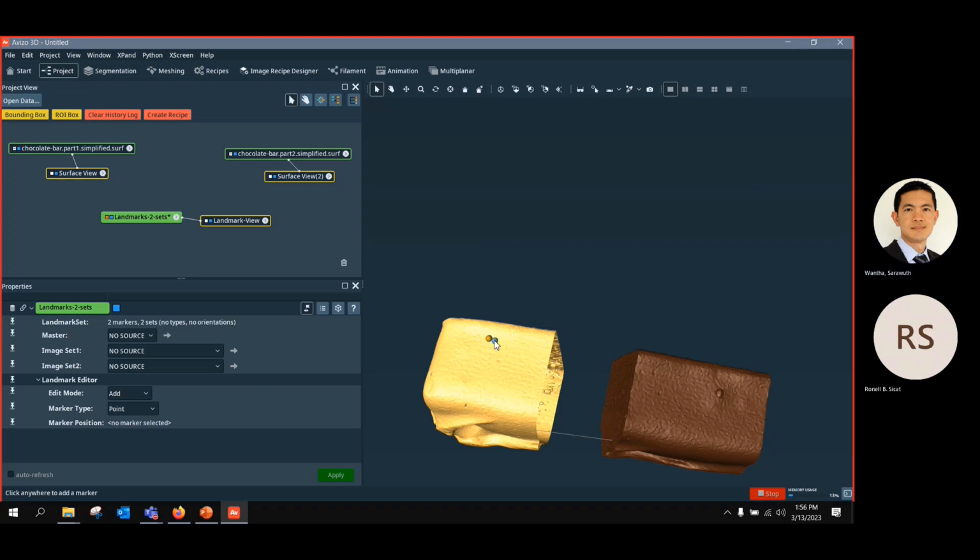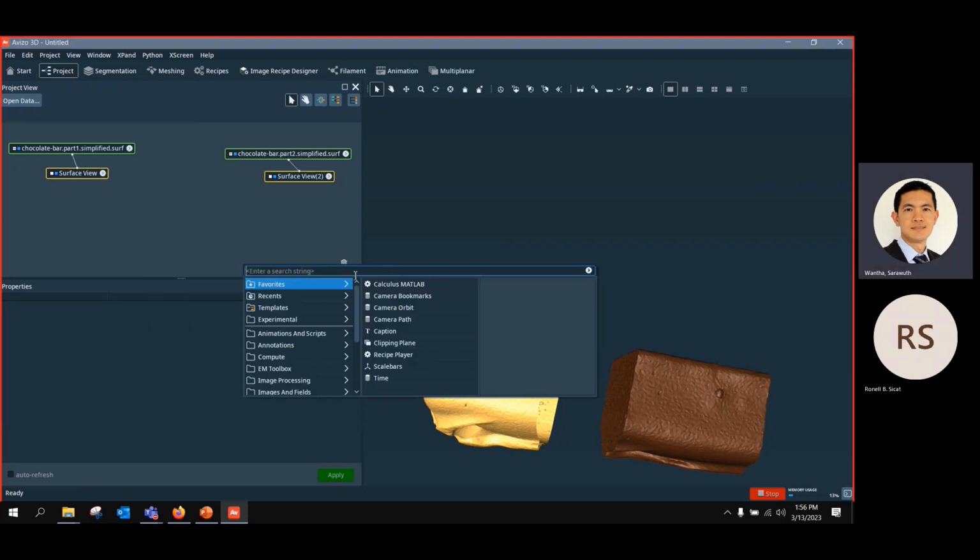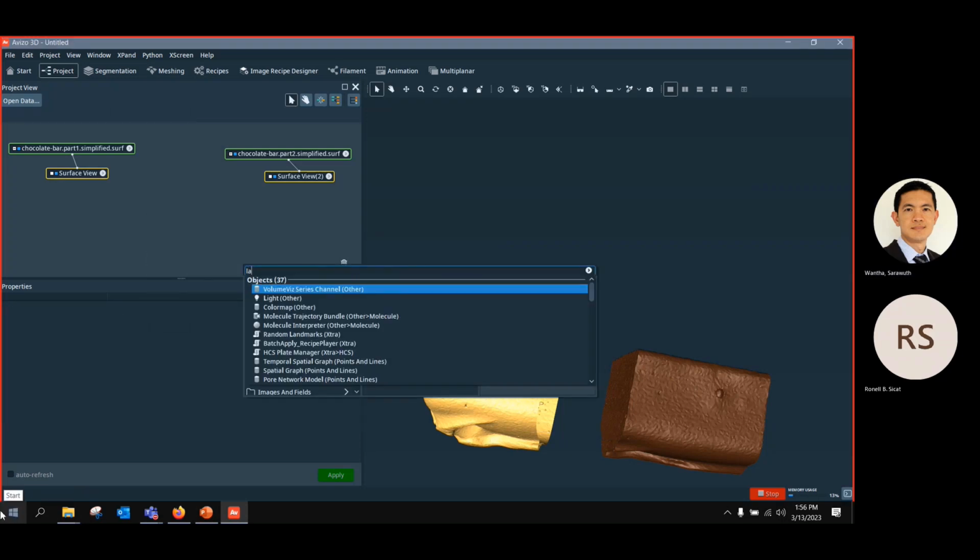No. So I should delete this. Now I made a mistake, so I'll do it one more time. Sorry. Create objects and landmark to set.